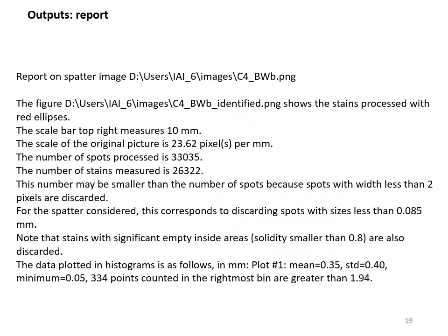You have to write reports, so that thing does it for you. It outputs a text file that you can copy-paste in your reports, where it reminds you what figures you have measured, what is the size of the scale bar, what is the number of spots and stains that have been identified. I'll come to the difference between spots and stains in a few seconds. And it explains also what the histogram is about. There's also a bar that I didn't describe on top of the histogram that describes the average of your measurement and the standard deviation.